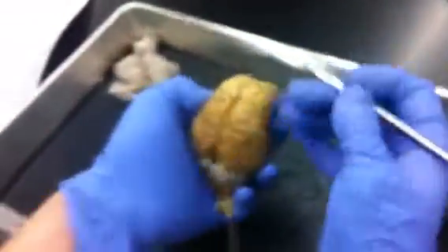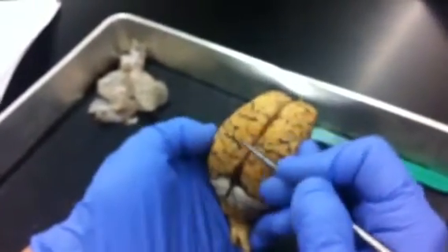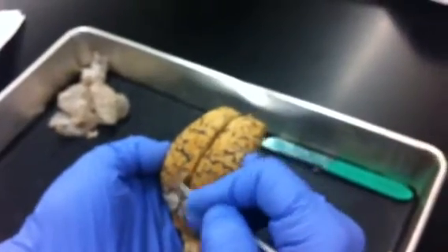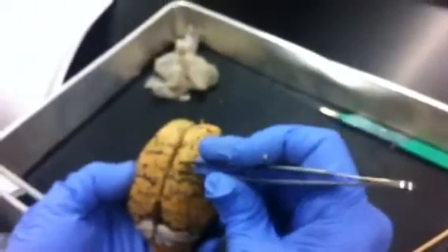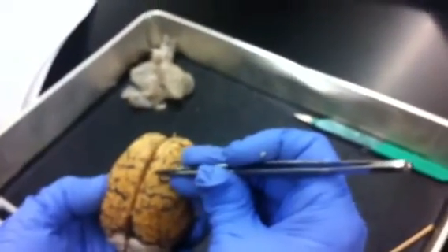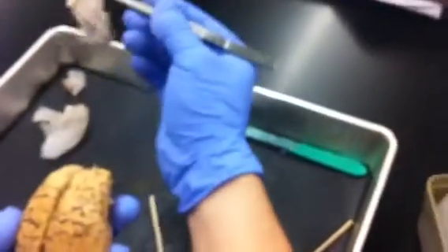Okay. The last thing here, so the raised areas are the gyri. The indentations are the sulci. And again, you can see these dark areas are blood vessels and blood in those blood vessels running through the sulci. If you very carefully grab a hold of here, you'll pull up the arachnoid. It's real spidery looking, so it'll come up in little pieces like that. That's the arachnoid. Okay. The pia is so tight underneath to the brain, you cannot pull it up, but that's the arachnoid. Obviously, the dura is the thickest.